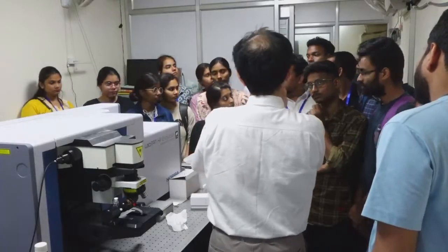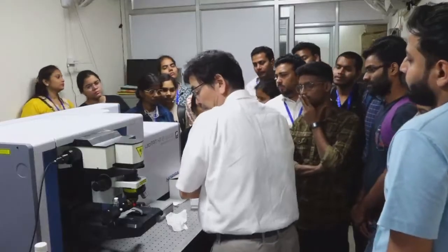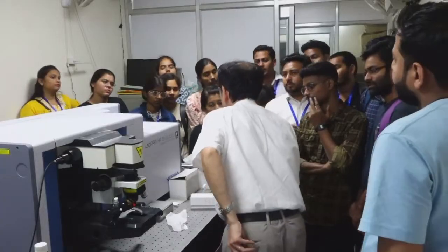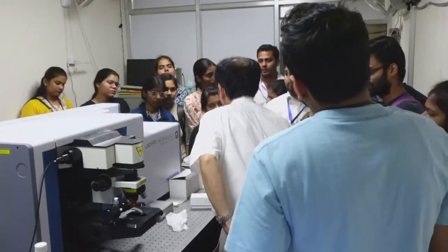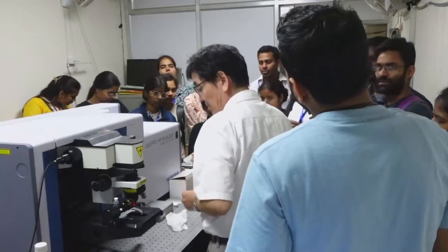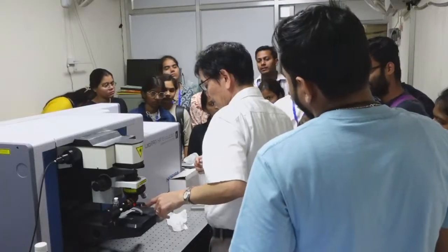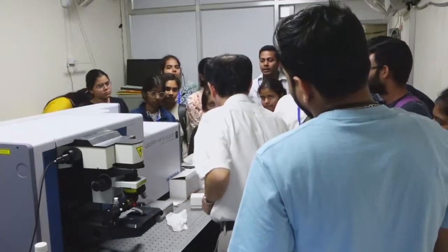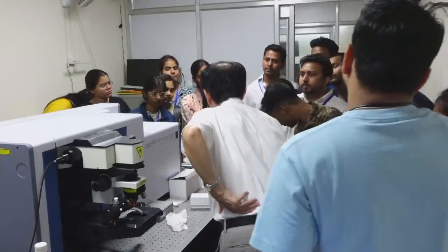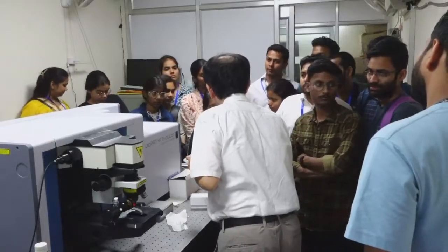Any other questions? How are scattered rays collected from the sample when we start the experiment for collecting Raman spectra? It's based on scattering of light.